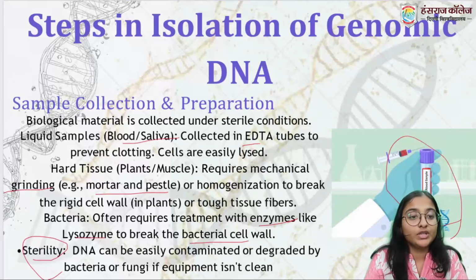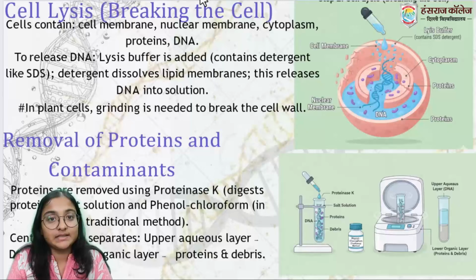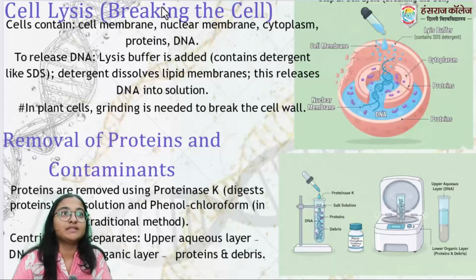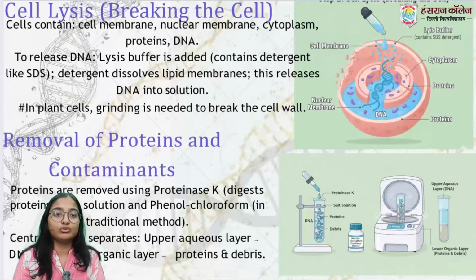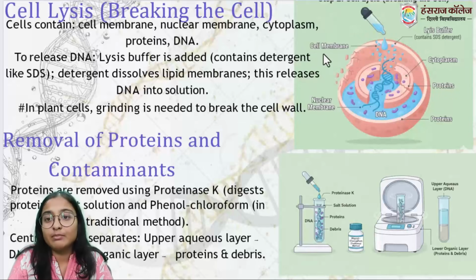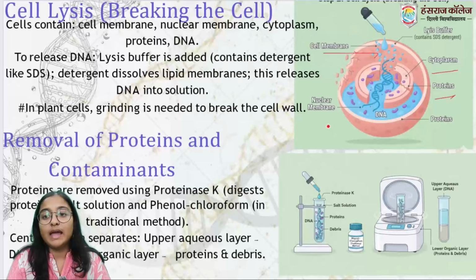Now let's move on to the next step, which is the cell lysis. What do we mean by cell lysis? Cell lysis is the breaking down of the cell. We all know the cell contains a cell membrane, the cytoplasm, proteins, and the DNA, obviously, inside the nucleus.